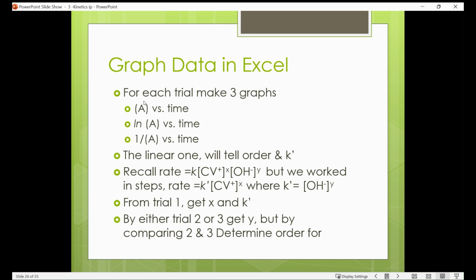We're going to try and fit these trends to figure out which one's the most linear, but you don't want to include that initial data before you inserted the CV. So you want to change the cutoff to account for when you put the CV in. You don't want to have that rise; it'll shift it.